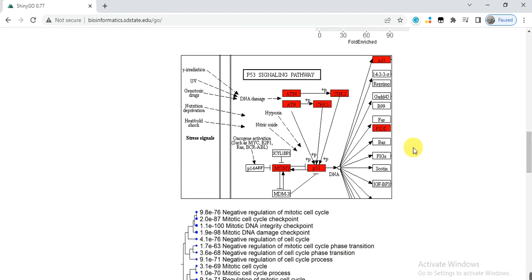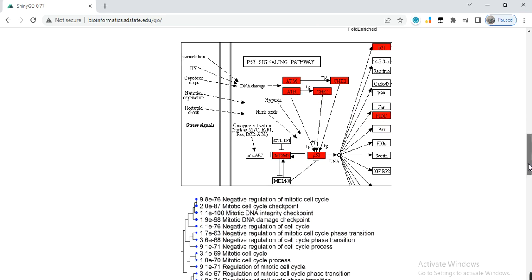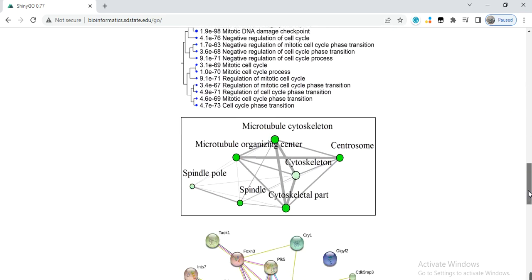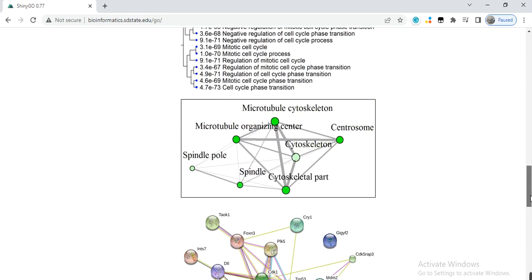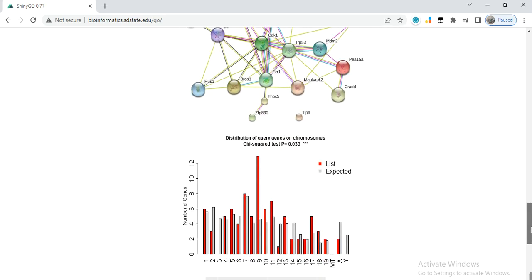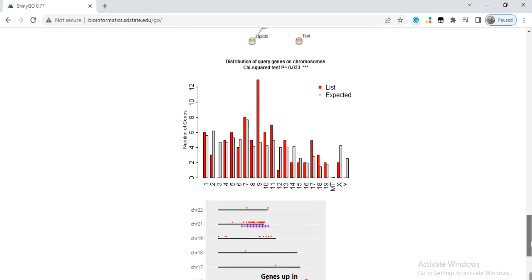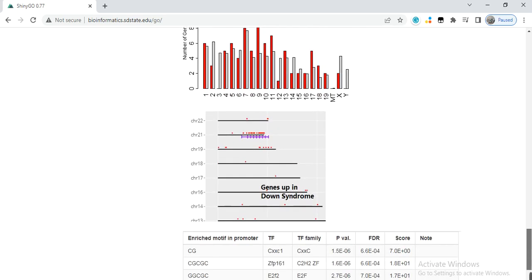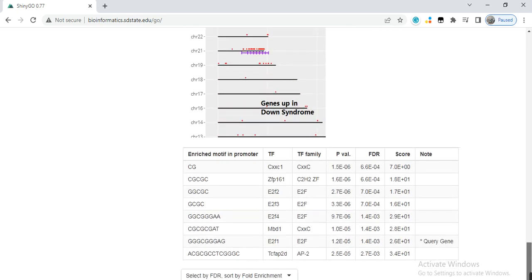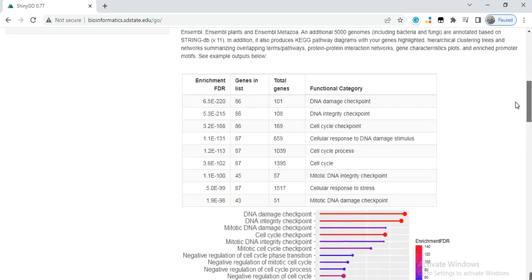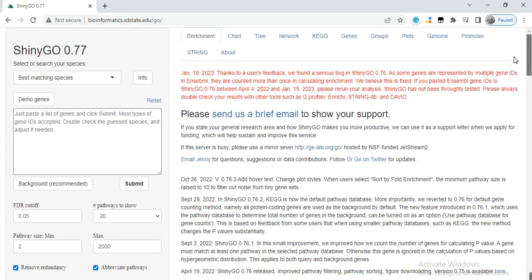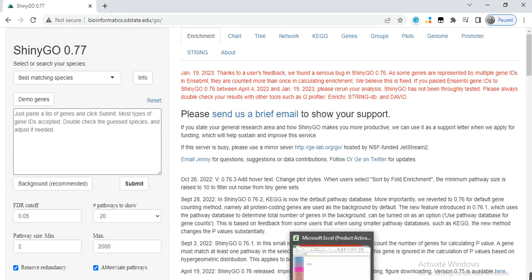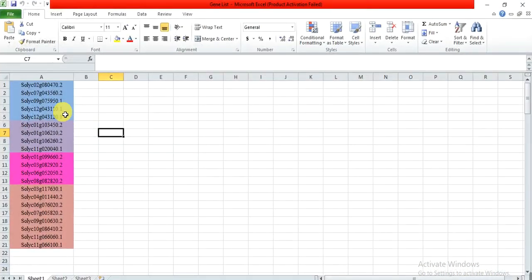You can get gene ontology, KEGG pathway, tree, or protein-protein interaction of your genes all in a single click on this website.